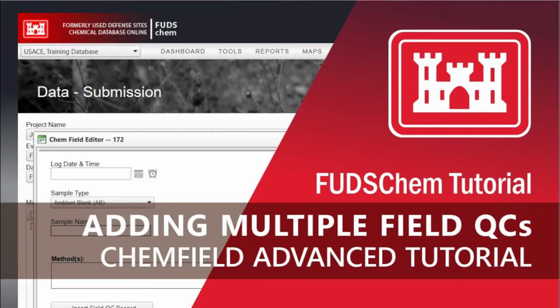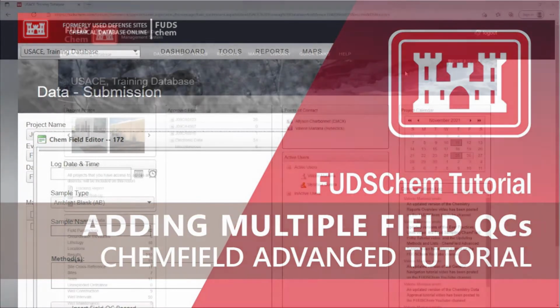This video will go over advanced tips for entering chain of custody data. It will include what to do if you have multiple field blanks from the same day, how to determine the lot number, and how to enter more unusual blanks.